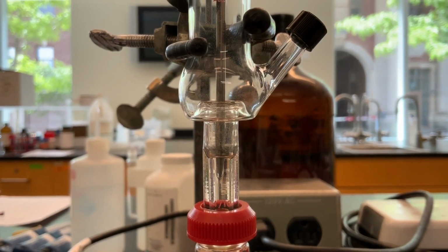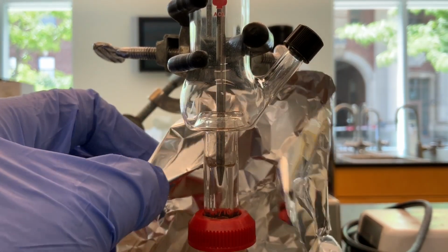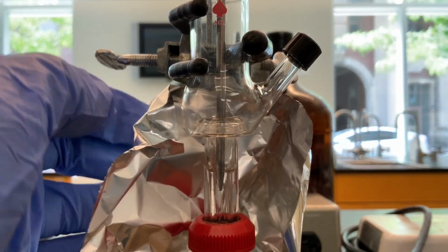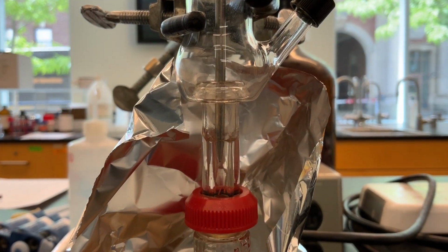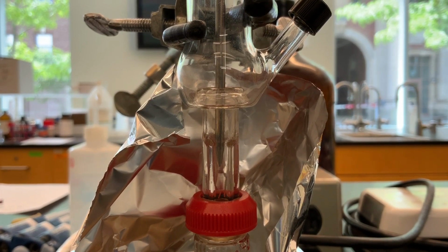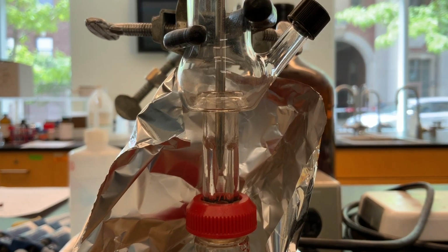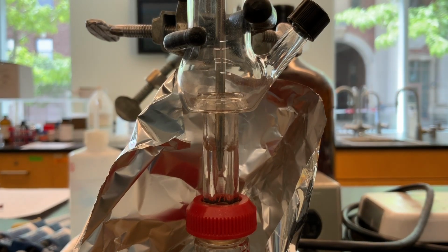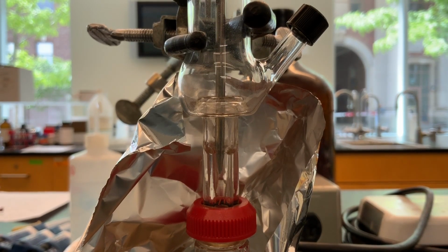It's very cold in this laboratory, so I'm actually going to use some foil to very gently insulate, so that the air in the lab won't continue to cool the glass, and it'll actually continue to climb upwards. So we're just loosely insulating it with this aluminum foil. And we already see that it's doing a pretty effective job at that.